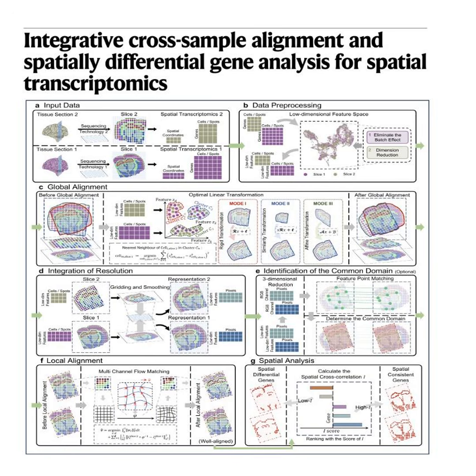If we connect this to the bigger picture, now that CODA has perfectly aligned these tissue slices, we can finally ask, what new biological secrets can it see? And the answer to that lies in understanding the difference between SCGs and SDGs. Let's define those for the listener.